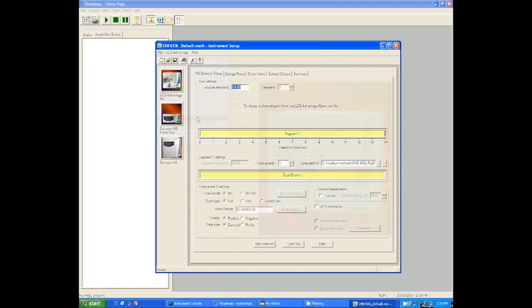When you're done programming the LC method, go to those pictures on the left again and click on the top picture. That's the mass spectrometer, and the window for all the mass spectrometer parameters should come up.